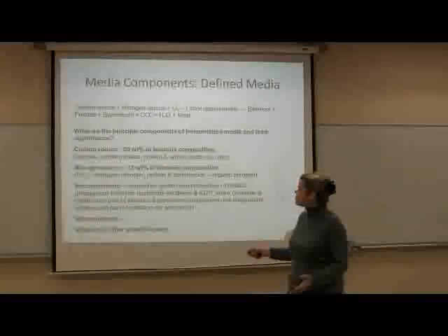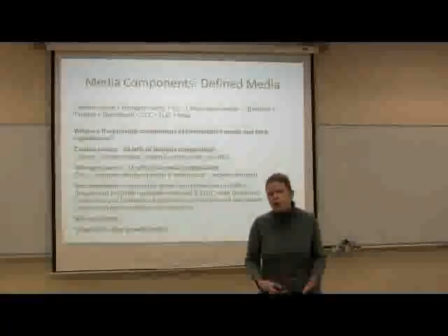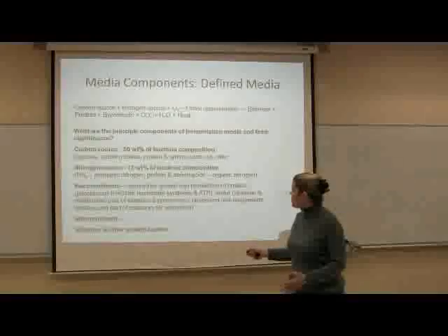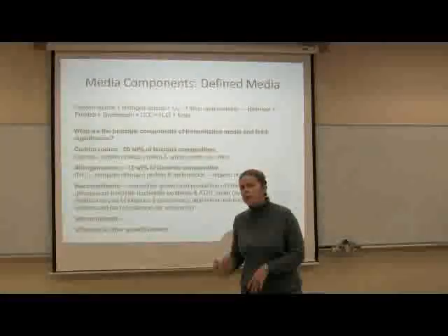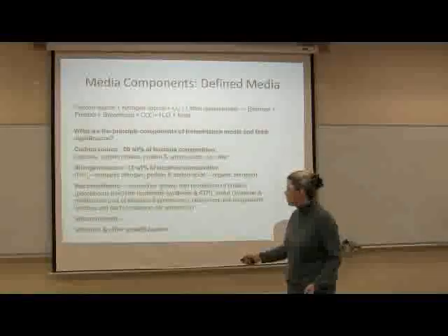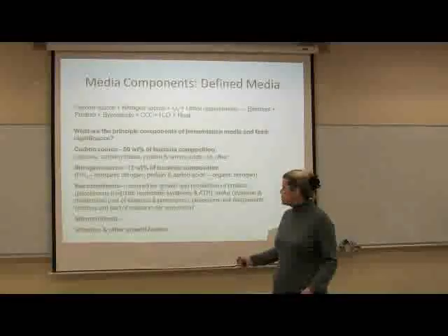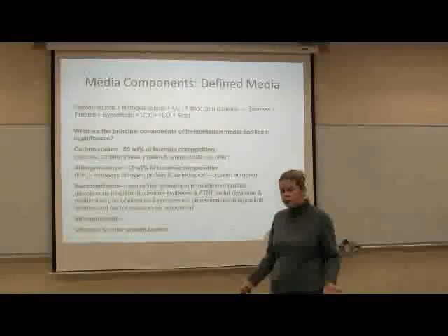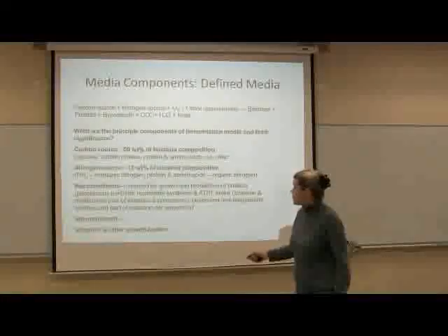And there's also micronutrients, which would be like manganese and cobalt and iron and other ones. We're not going to worry about them because they're going to be in our LB medium, in the yeast extract, so we're not going to have to worry about including these micronutrients. And there's also vitamins and other growth factors in the yeast extract and the tryptone that's in the LB medium, so we don't need to worry about these either.